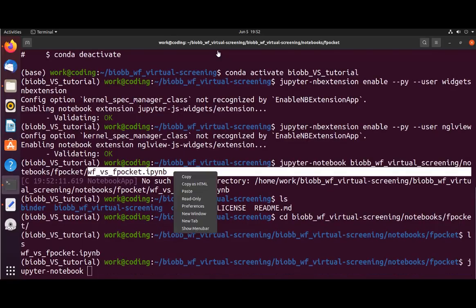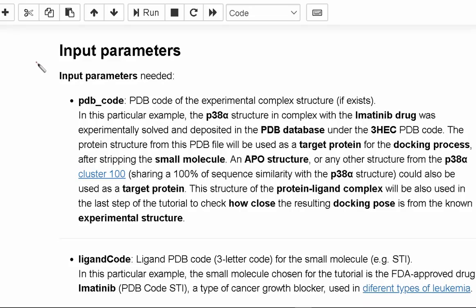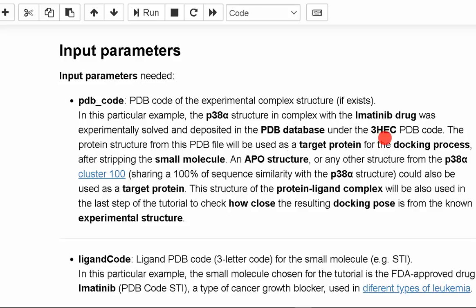There are three input parameters needed. The first parameter is the PDB code of the experimental complex structure. The P38 structure in association with the imatinib medication was solved experimentally and deposited in the PDB database under the 3HEC PDB code in this case.